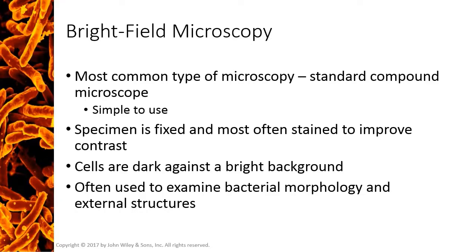So this type of microscopy cannot be used to view any movement or functions of living cells. Instead, you use bright field microscopy to examine cell morphology and external structures. In fact, there are different staining procedures used depending on what morphological information you hope to learn. We will discuss those staining protocols as we discuss the structures themselves in the next unit.